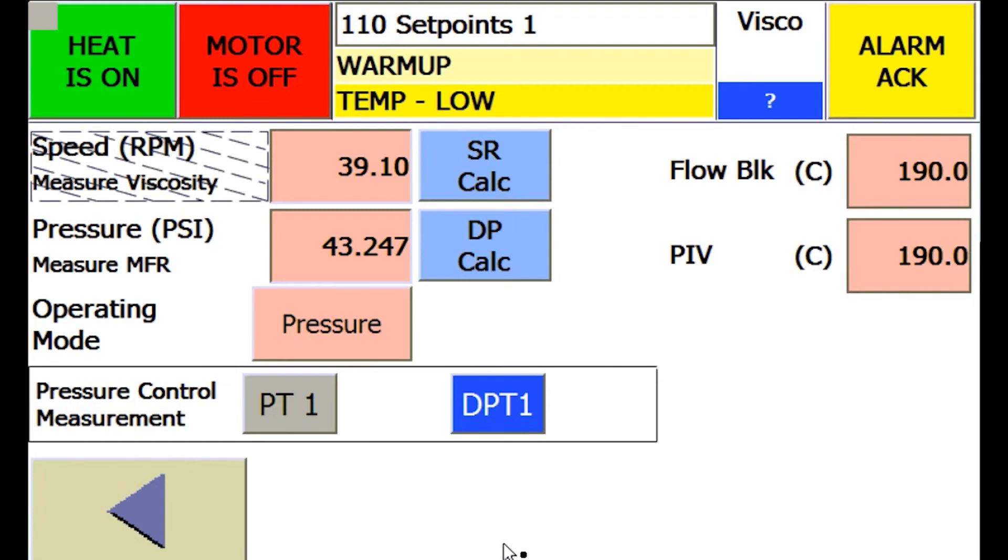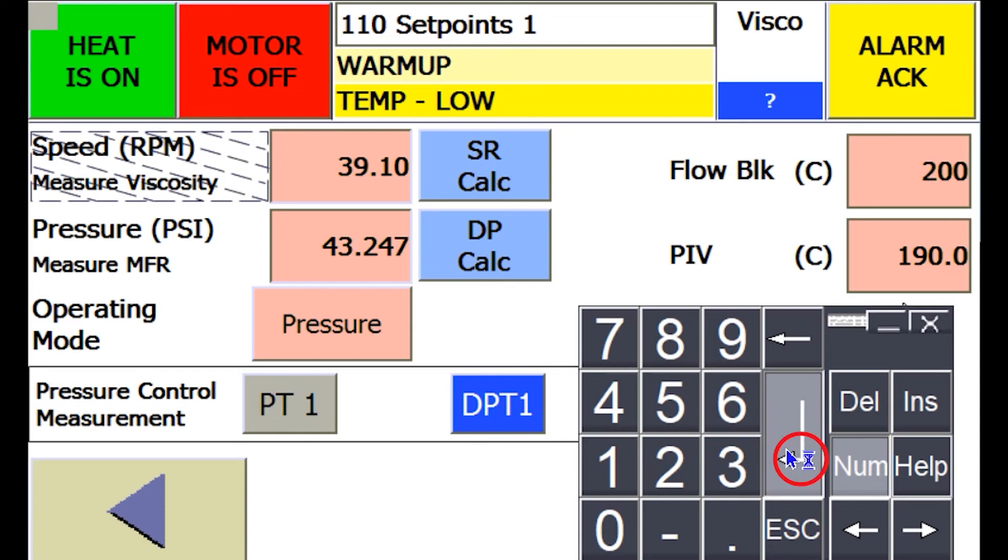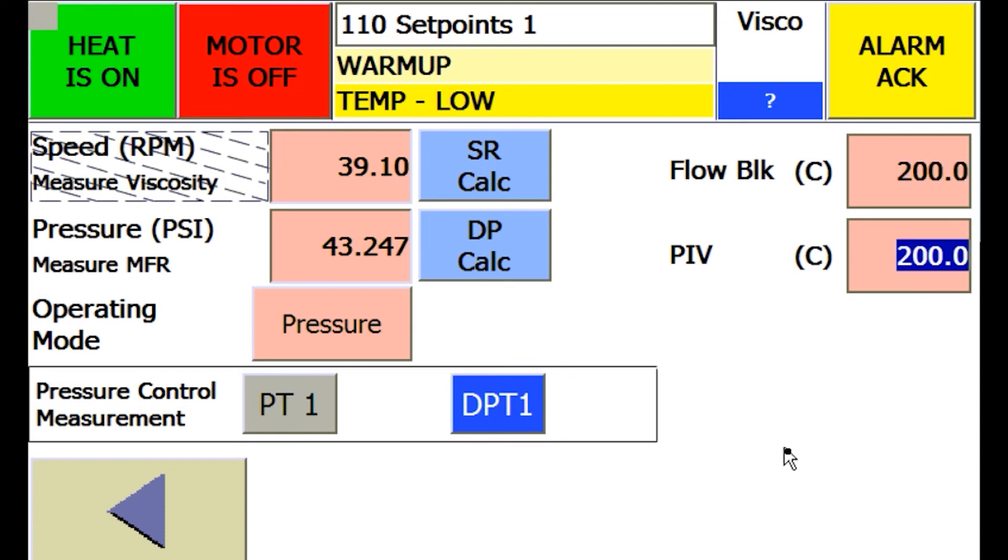For zone temperatures, simply enter by selecting inside the set point box and a keypad will pop up. You can enter the set point of the temperature you would like. You do not have to hit an activate or run button. Once entered, the system will automatically control the entered set points going forward.